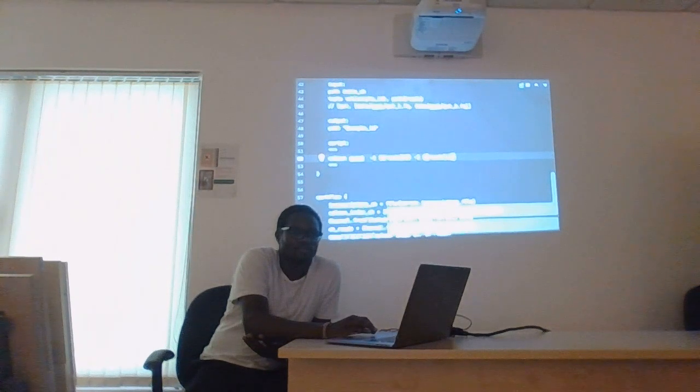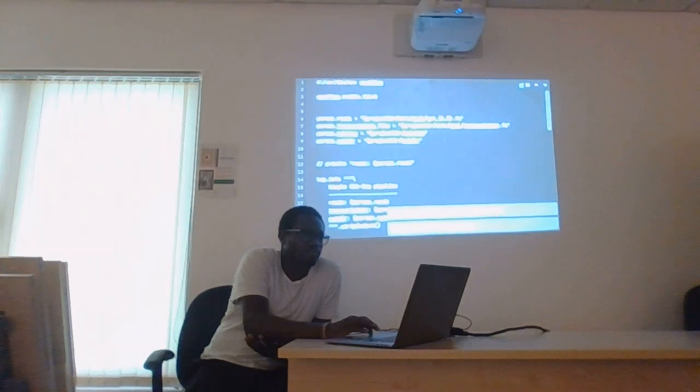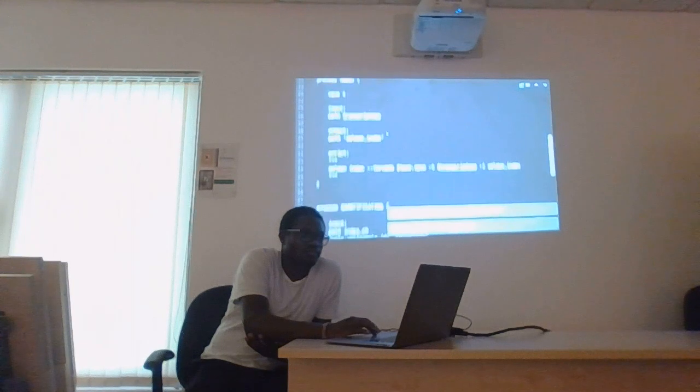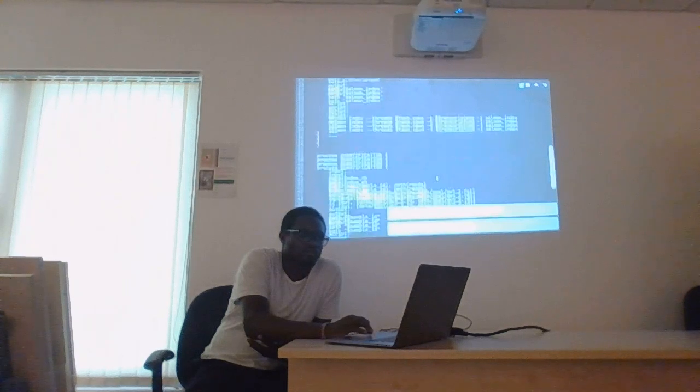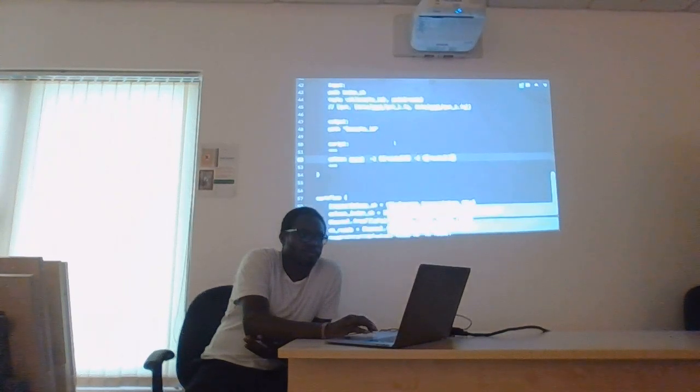So I've seen, after declaring the path, there is the next quantification process. There is input, and we declare the input. I think that we choose any name, but it should be relating to what we are doing. Yeah, so these can be any name. So these are basically channels. They refer to.